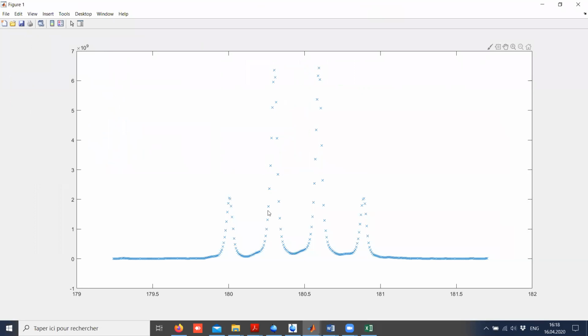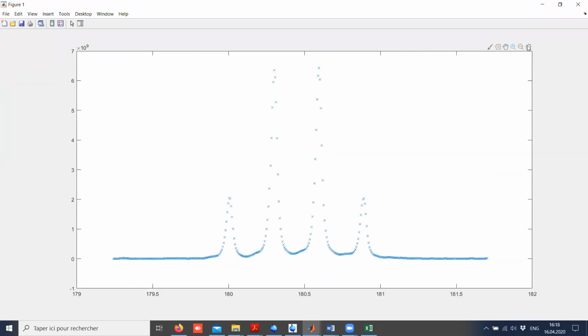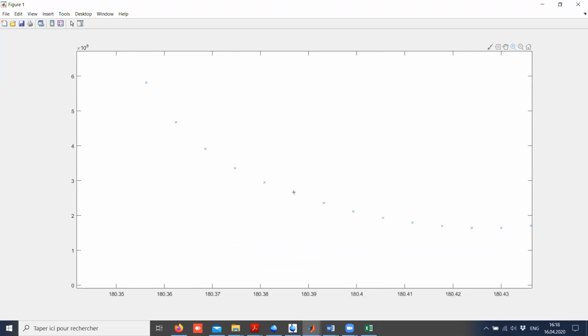Now my sum is always the sum of a point multiplied by the difference of frequency. So I'm really summing the area as a square and no longer as just points. Now I'm summing this rectangle here and then this rectangle, but no longer just the points.